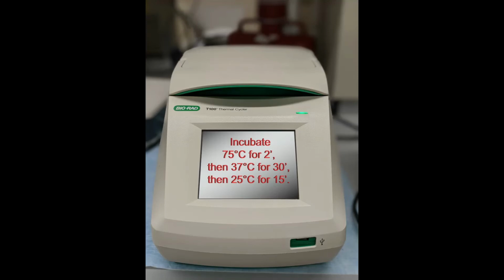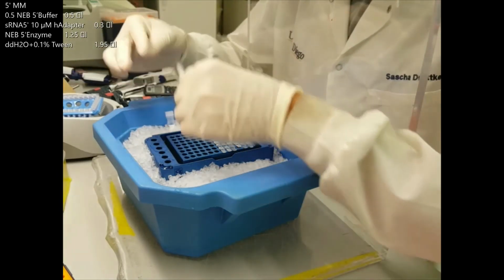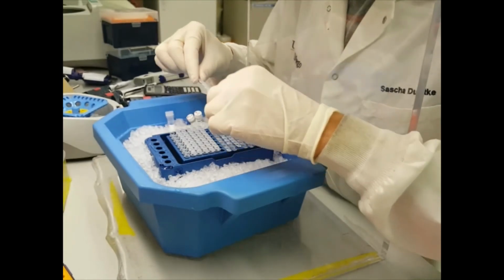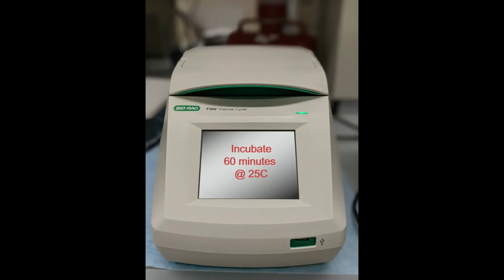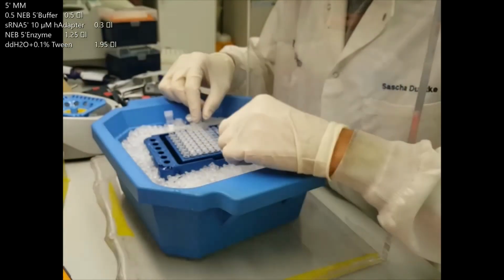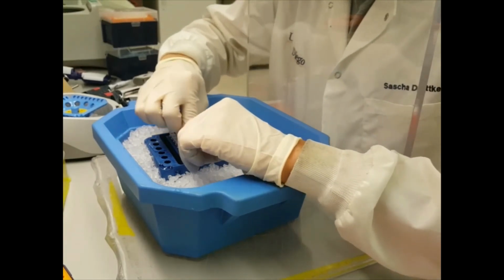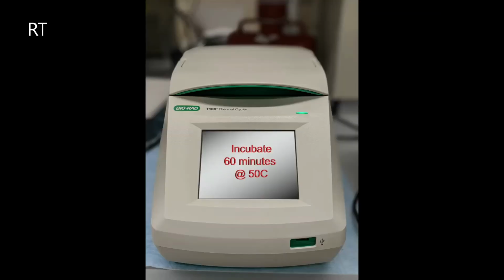Meanwhile, you can prepare the 5' adapter mix and already pipette it out into PCR strip tubes. Once the hybridization is completed, well, guess what? Yeah, you can quickly now exchange the lids, mix the samples and start the reaction. This gives you another 50 to 55 minute break till you prepare the RT master mix that again you can add into the lids, and once the 5' adapter ligation is completed, exchange the lids. You got it. Mix the samples well, quick spin and incubate the RT reaction at 50 degrees for an hour.